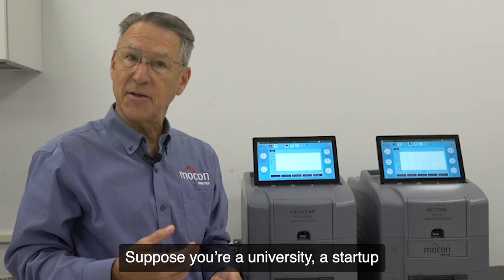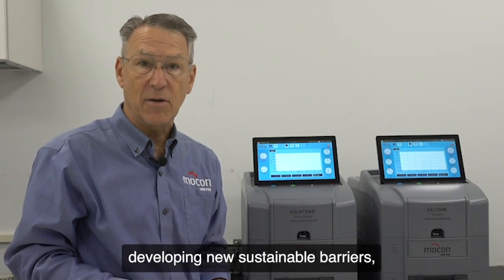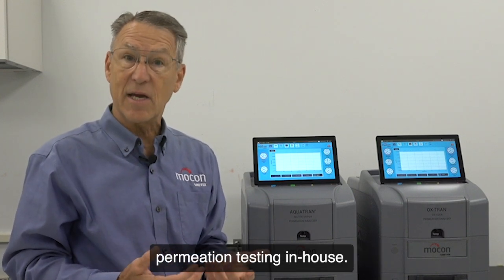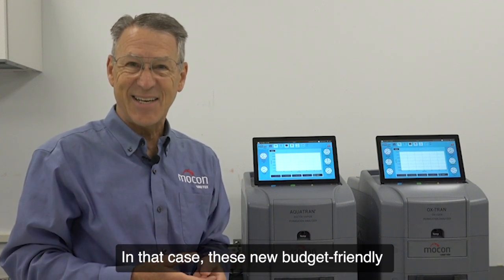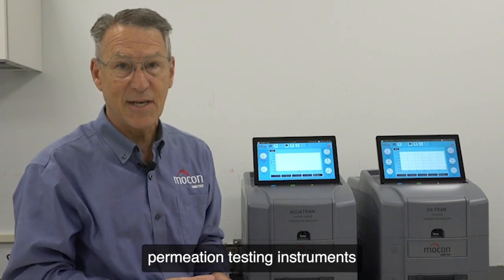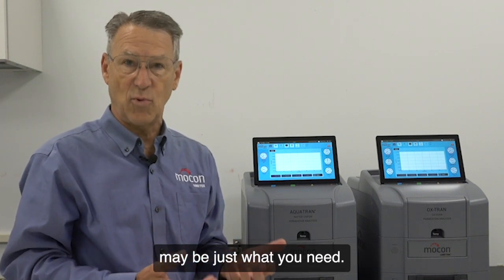Suppose you're a university, a startup developing new sustainable barriers, or a growing lab looking to increase your efficiency by bringing your permeation testing in-house. In that case, these new budget-friendly models of our most popular permeation testing instruments may be just what you need.